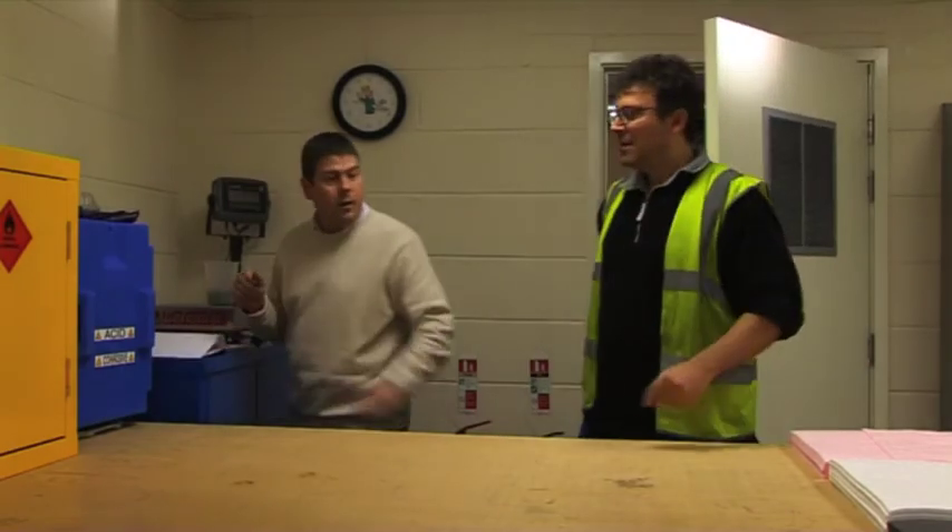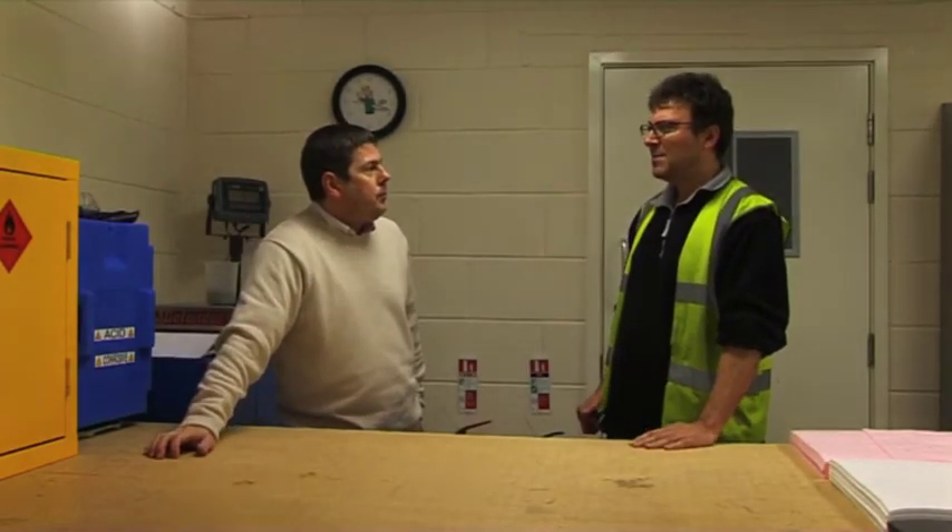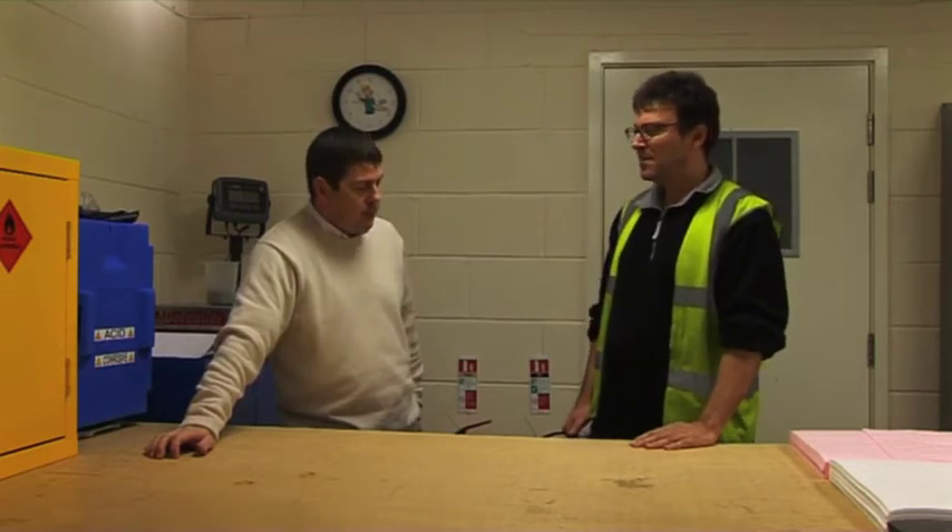Hey John. Oh, hi Pete. I was just talking to customer service, and they received a phone call from a customer saying they've had a battery acid spill from one of their forklifts. What they wanted to know was: will Pig Hazmat absorb battery acid?